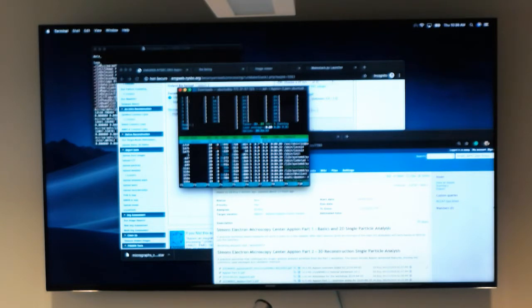In that case, you might have to delete if you wanted to just get a feel for the environment more. So what are we giving you? 240 gigs of RAM, 32 CPUs, 2 GPUs, and 100 gigs of scratch space. In addition to that, we also have all the test data sets. And if you run into trouble, we already have a folder that has pre-run all the jobs. So if a job is taking too long or you get stuck, you could always go into a save point and try another feature.